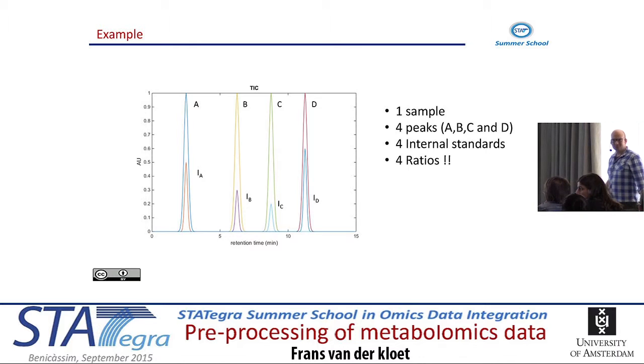Yeah, but that's an issue. That's a real big issue, because there's no way of telling which compounds you will find, and I think that's a very important point. So usually what you do is you take a set of compounds that you expect to be in your method, what you expect to detect. For example, in lipids you say, well, this is a triglyceride, so you have this one, and for the diglycerides you have this group, you have this reference, and that's the way you do it.